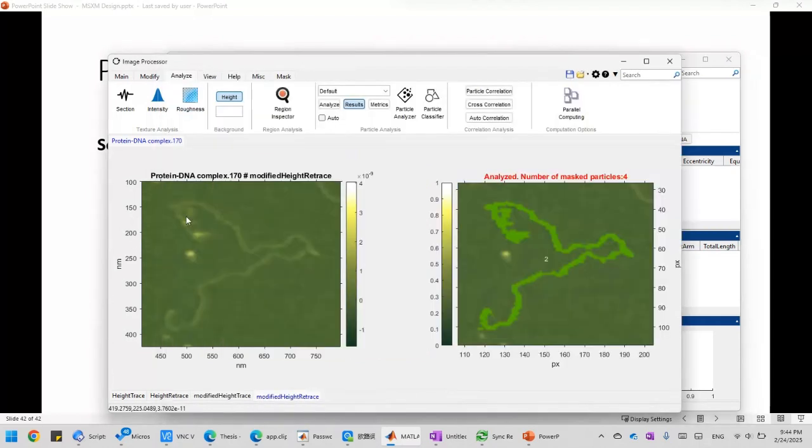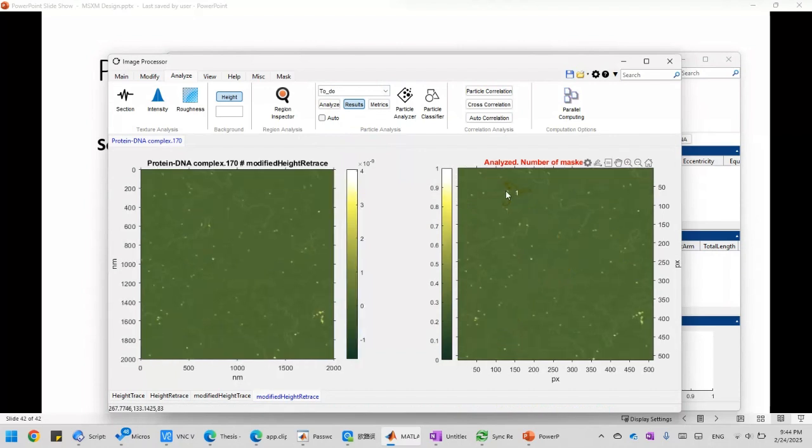For example, I have already included this particle in my to-do set. Let's click that. Now, if you zoom in, you can see in this to-do set there's only one molecule, the one we just added. So let's say I can save my workspace into a file and go to sleep, and then after a week or two, when I converge with my colleagues, I can go back to this analysis.